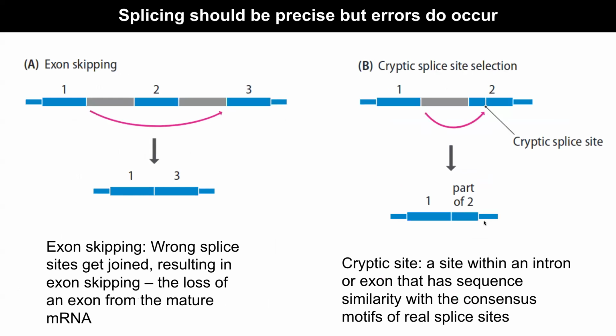What is the mechanism? That's hard to figure out from a sequencing experiment. What I'm saying is, I take my heart, I take my kidney. I have no idea which isoforms are there in my heart and which isoforms are there in my kidney. If I do a sequencing experiment, I know that their DNA is going to be very simple, but I have no idea what their RNA is. I can do the sequencing experiment and figure out which genes have how many copies of the mRNA, because if I take that read, it will align to the gene. What I also want to know is which isoforms are there. That is the problem. We'll touch upon this in a bit. Does that make sense?